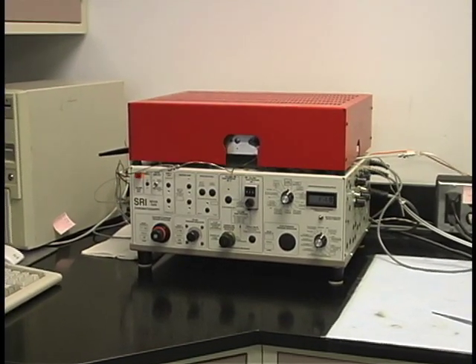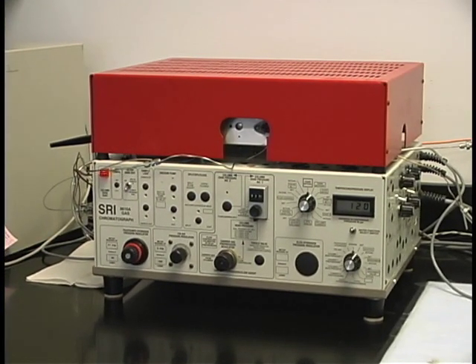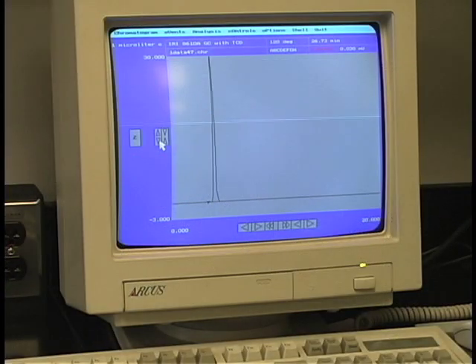With the aid of a multi-channel sampling loop, fixed volume samples, typically 1 milliliter, of the gaseous output from the system can be sent through the chromatograph. Separation of the gases in the HayeSep D packed column under helium flow is easily accomplished. The output from the thermal conductivity detector is shown on the screen. In this case, only a single peak, whose retention time corresponds to hydrogen, is shown.